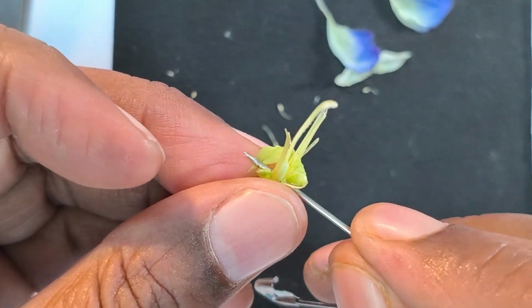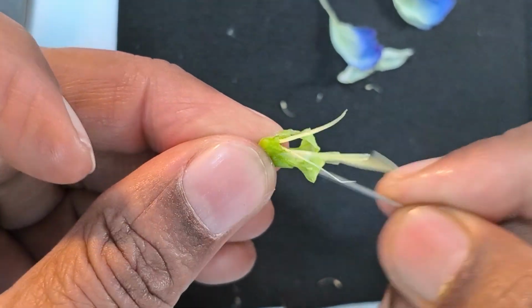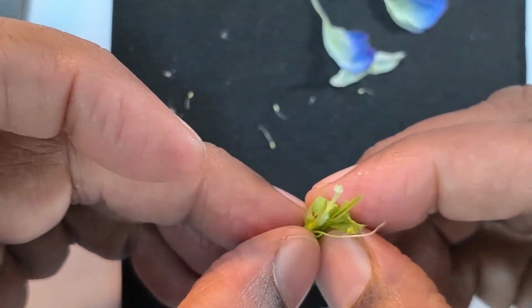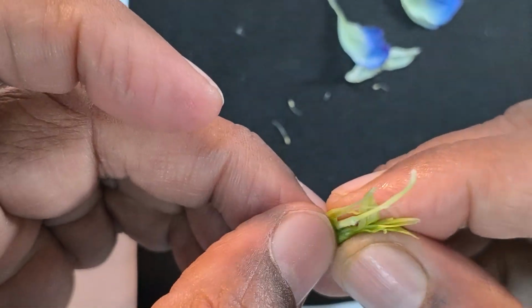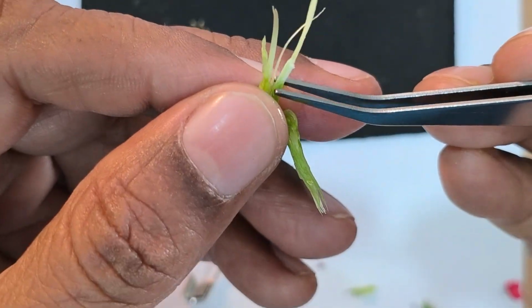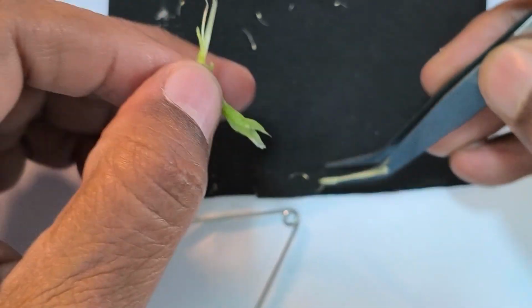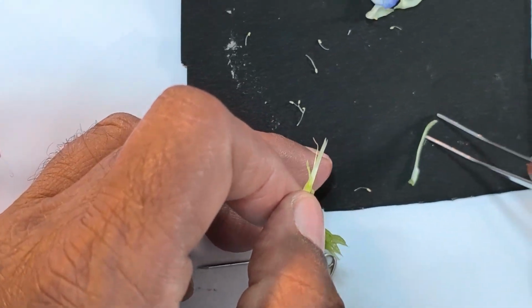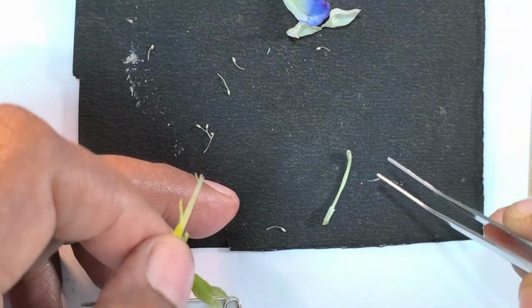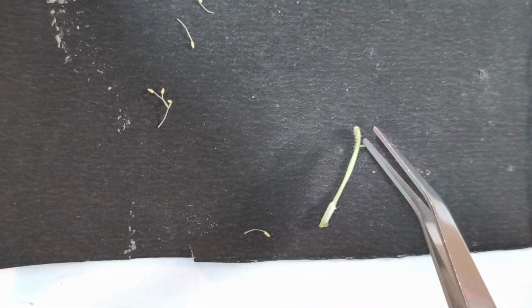Now I am just showing you the ovary, style, and feathery stigma.